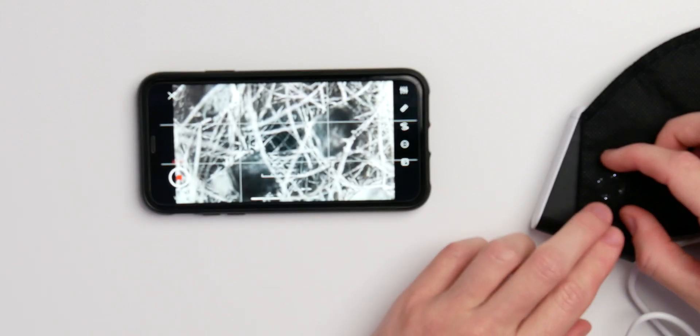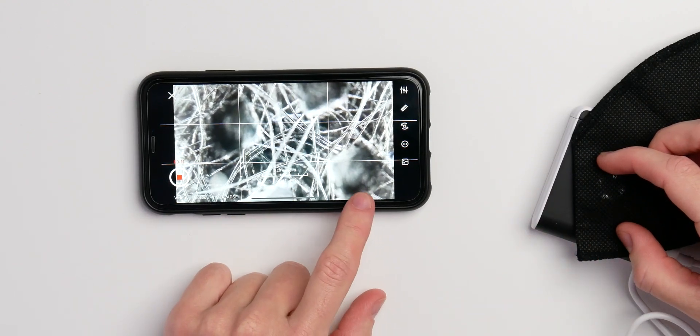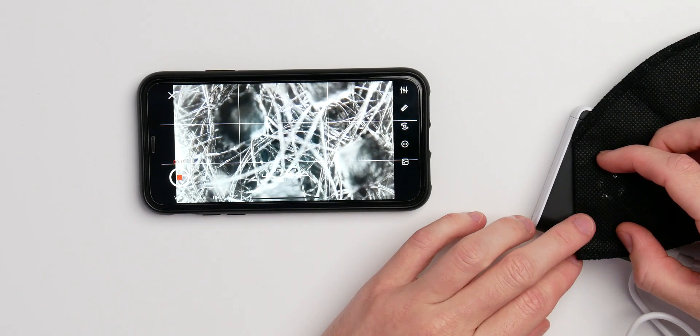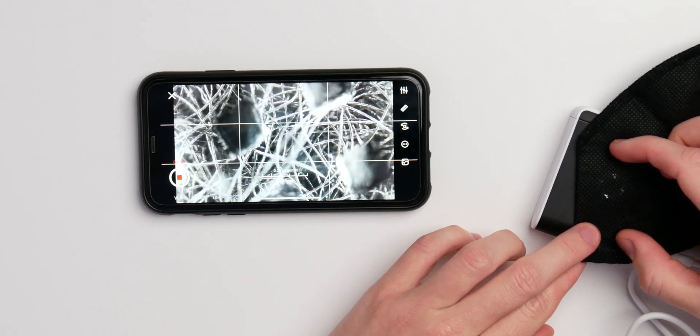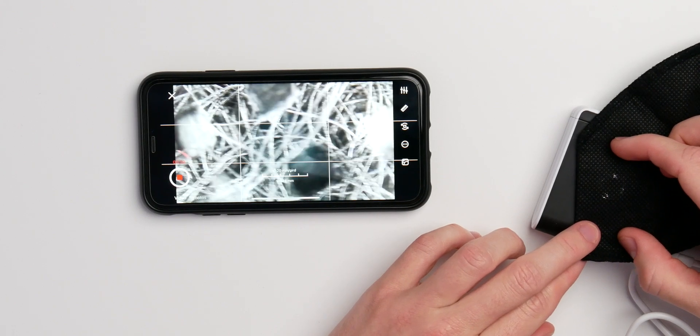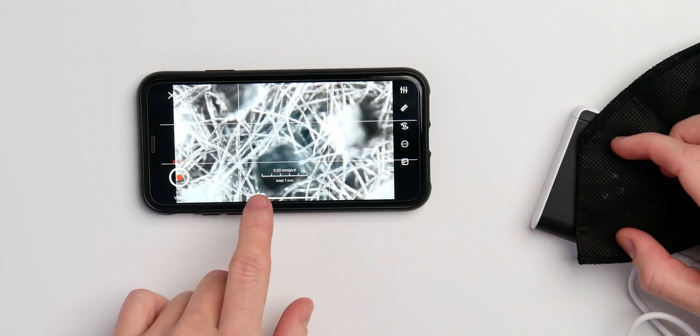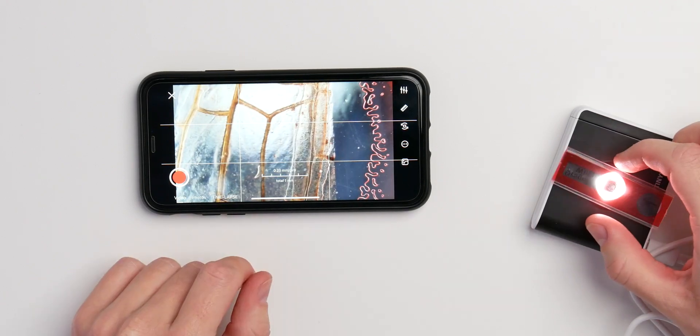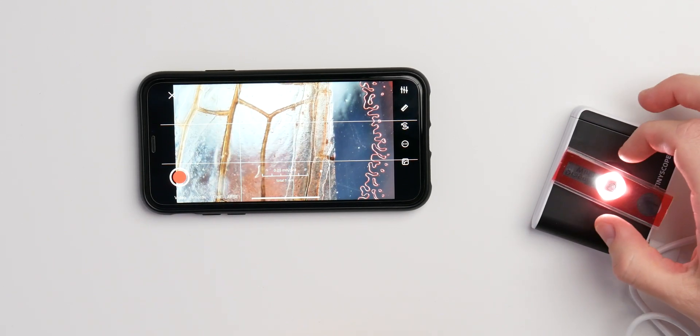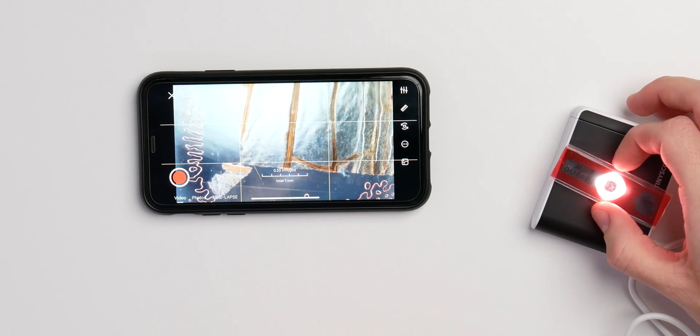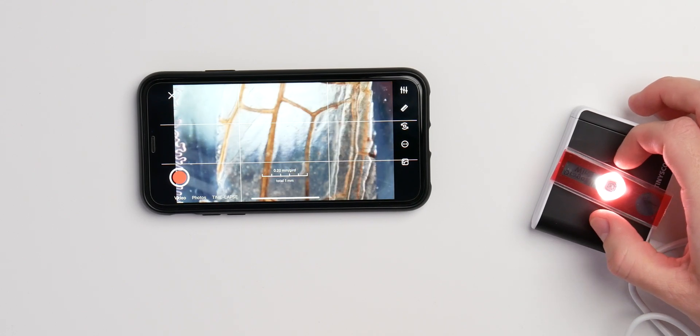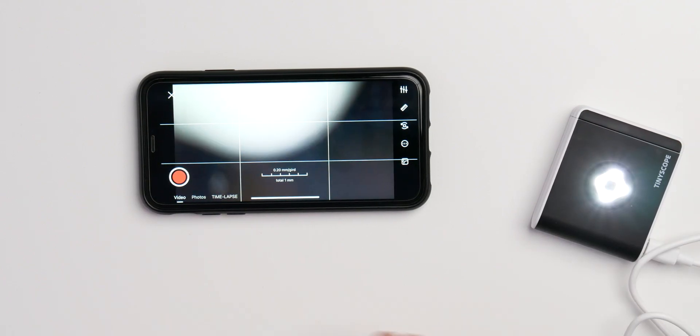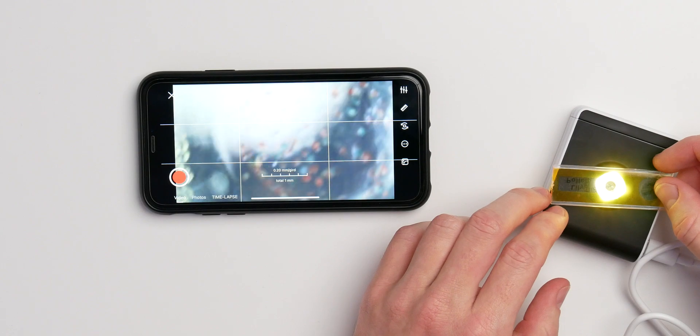Also just make a video if I want to. Just have all these dots here and then all the fabric and the connectors in between. And every single one of these is roughly one millimeter big, as you can also see here. But you can also take a look at maybe this dragonfly wing here. This is one of the samples you get with your microscope. It looks in my opinion super crisp, super sharp.